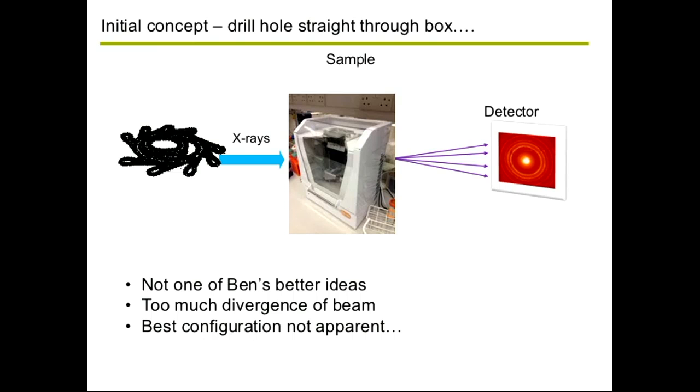And so I wanted to put the nanoassembler in the beam. This was actually inspired by a guy at UCL, Simon Gaisford, who does a lot of thermal characterisation of materials. He went to Mettler and said, I want to drill a hole straight through my DSC so that I can shoot X-rays through the aluminium pan and see if we can do in situ diffraction. And it actually worked. And so that inspired me to say, well, maybe we can just drill a hole in the front of the nanoassembler and then drill a hole in the back and get scattering out of the material that's in the channel, and that'll solve the problem for us.